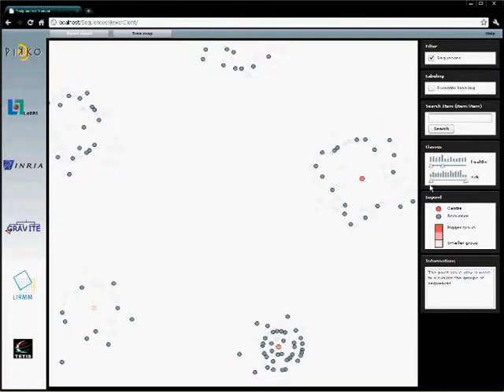Using the sliders, we can find the sequences shared by a lot of sick people and a few healthy ones. Here the group looks to be of particular interest because sequences are shared by a lot of sick people. We can postulate on a correlation between WINS1 and disease.